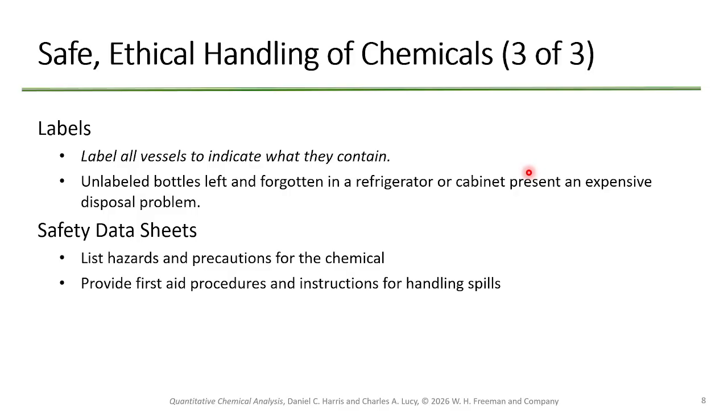If you update that chemical for whatever reason, like add something new to it, add a new date, that's when you changed it, and add the new conditions. Okay? Anybody have any questions about that? All right. If we find any bottles that don't have all this information on it, what's going to happen? Yep, it is going to go in the waste. Yeah. And I'm going to have to do some treatments on it. So if you're lucky, I'll have it sitting in the waste compartment, not yet poured out.